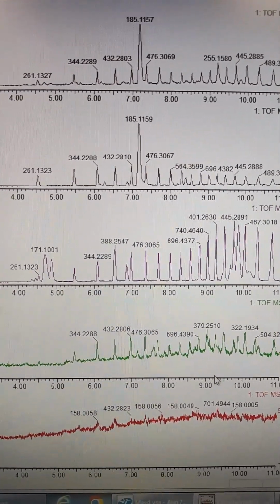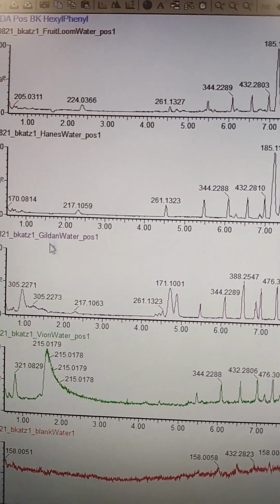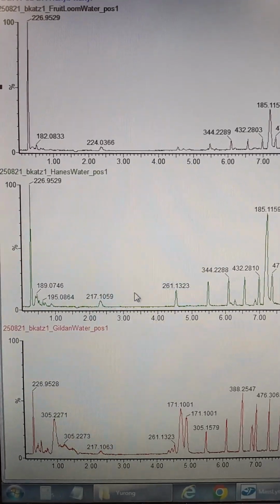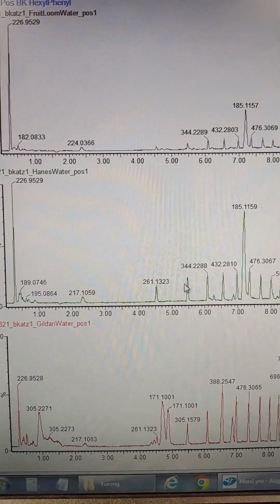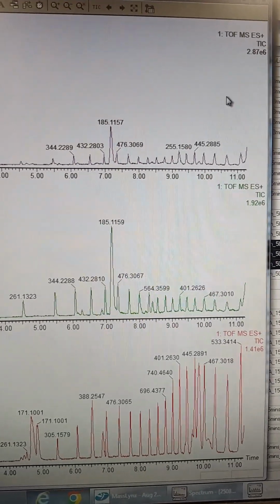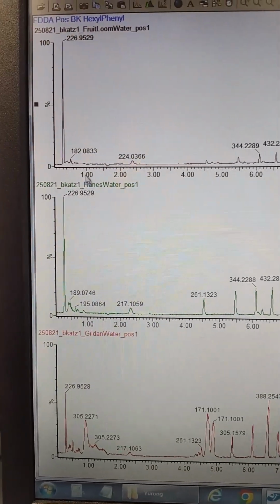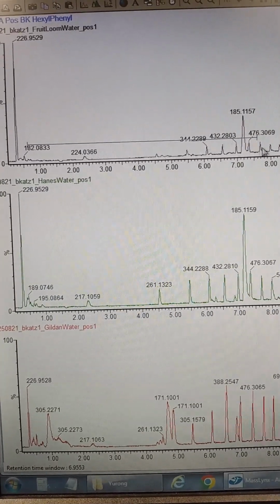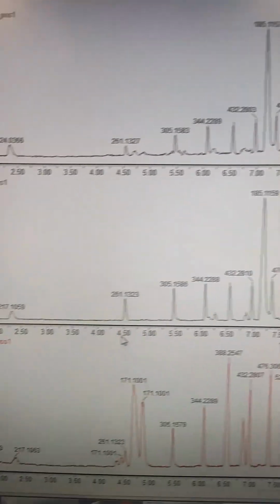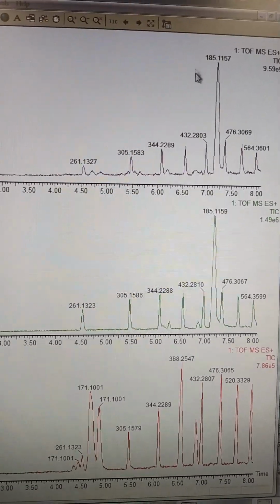So we're going to go ahead and just compare the 3 cheap shirts for the rest of this. Alright, so comparing just the inexpensive shirts from Amazon, you can see that we have a difference in signal in this early region. And we have this really big kind of peak that's similar in all of them. So if we look really early, you can see that the Gildan does have some of the lowest numbers, and it doesn't include this 185 mass.